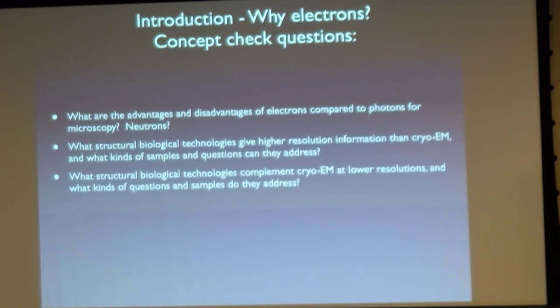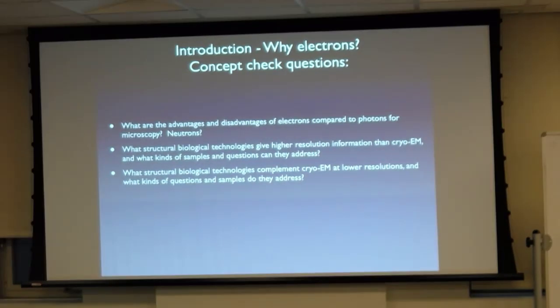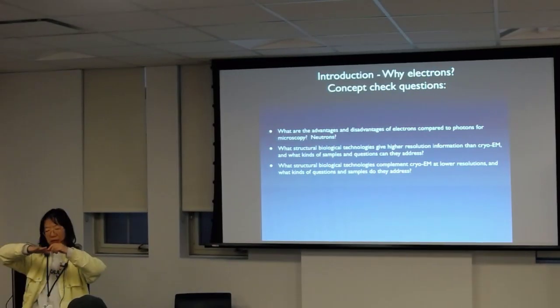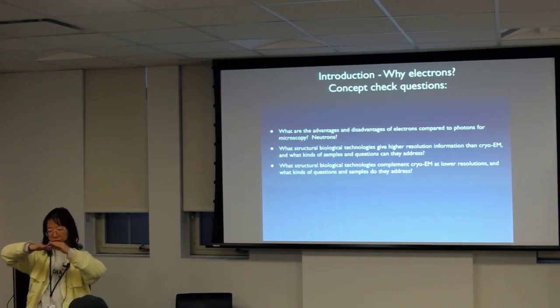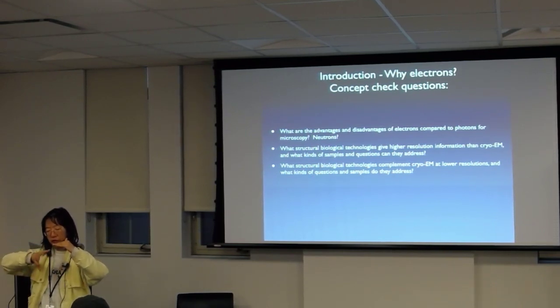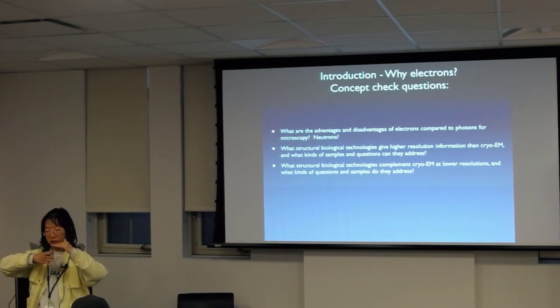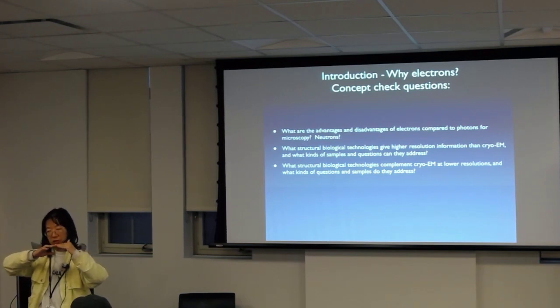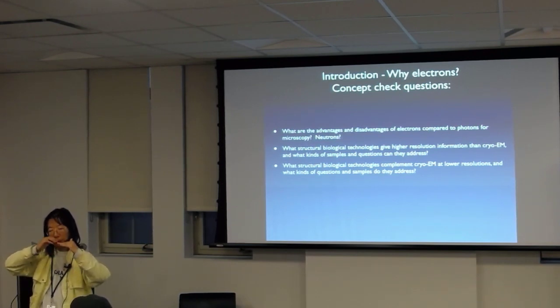Okay, the first part, when you are rocking it, when you are tilting it to make sure that it doesn't move around, to make sure your axis is right, that part you will be moving the stage to get to that height. The second part, when you adjust your objective lens to focus to that point, that is changing the objective lens. So when you change the defocus, you're changing the height of the objective.